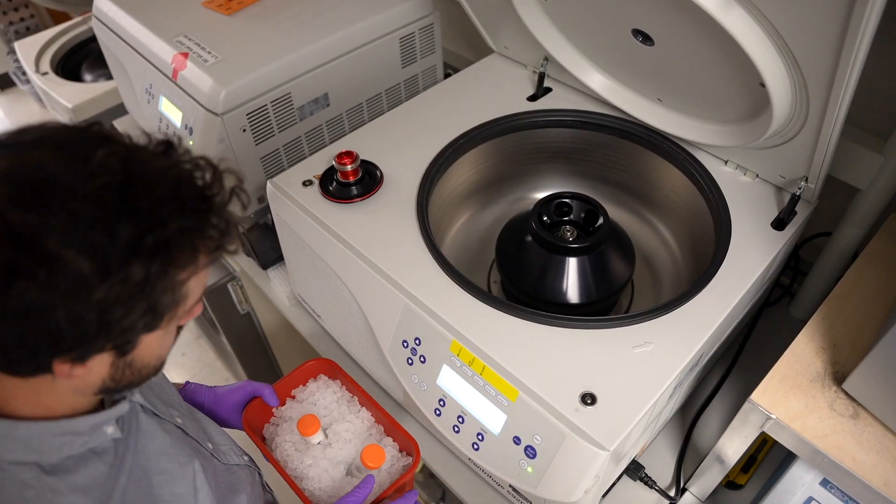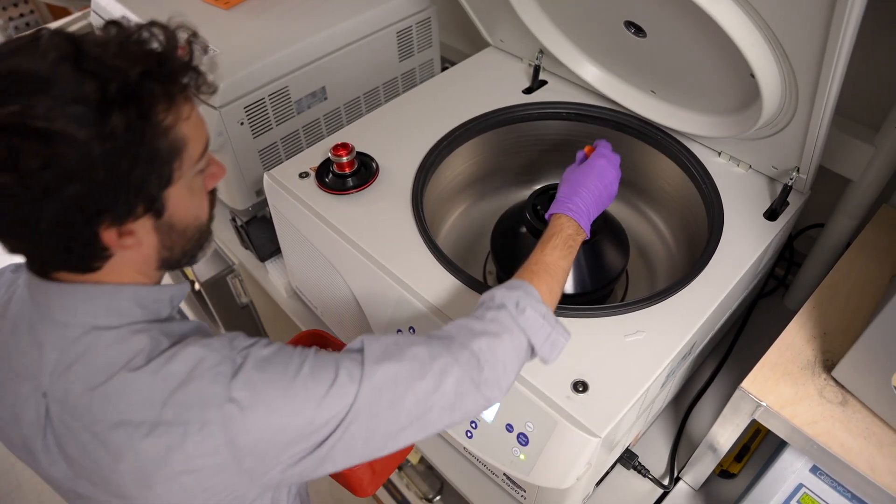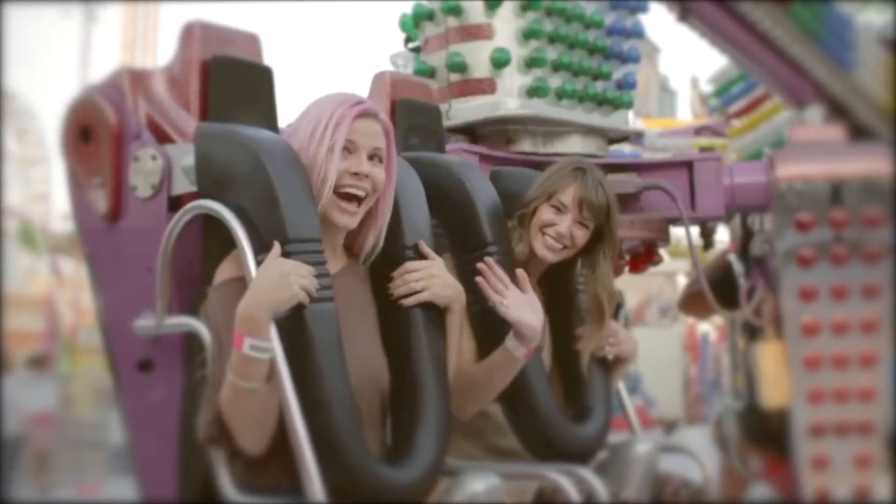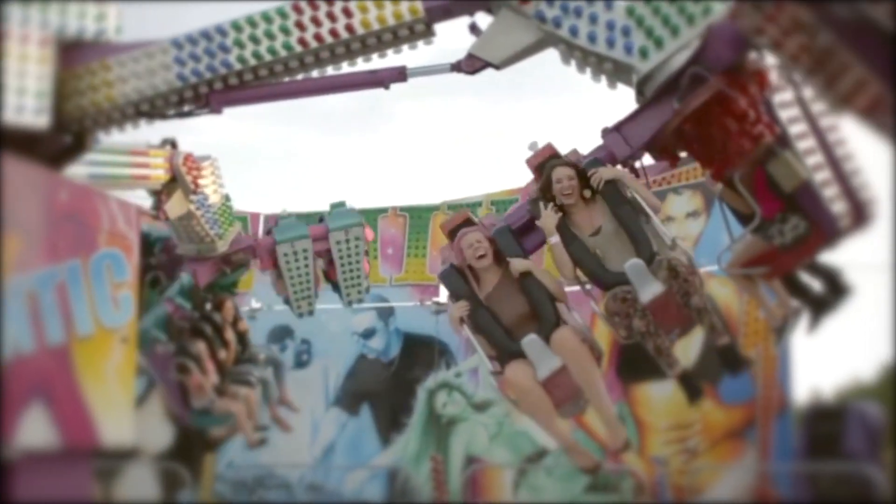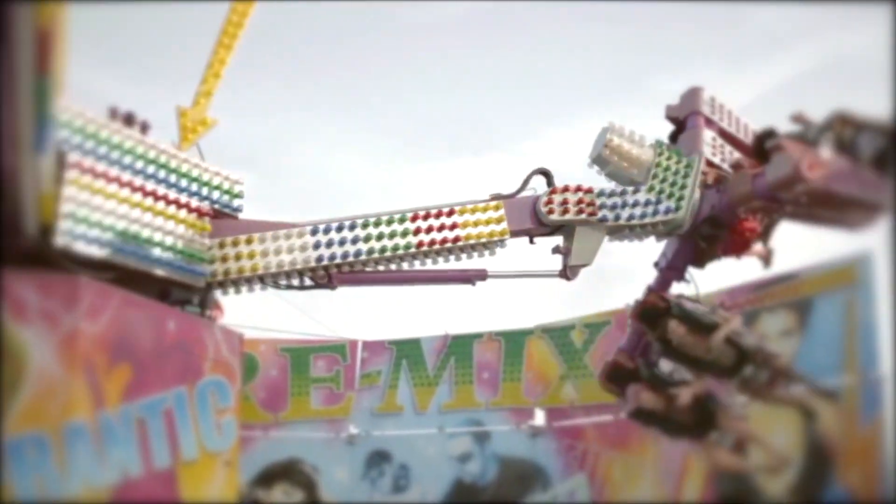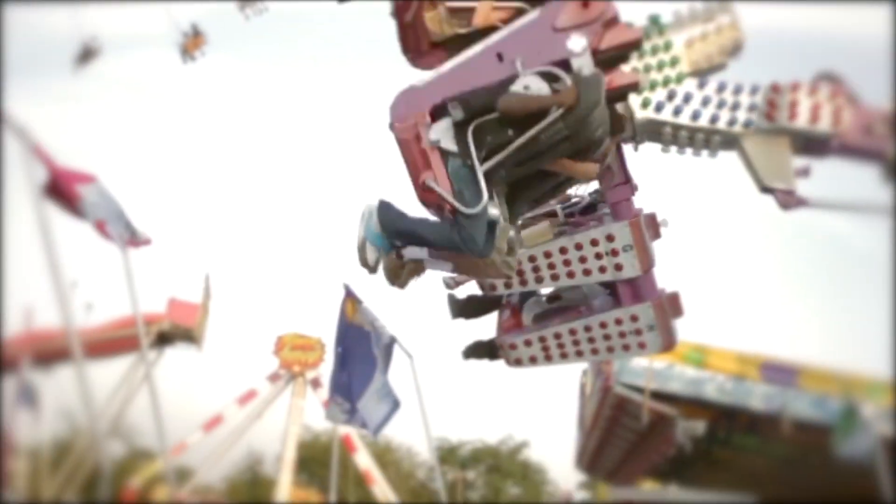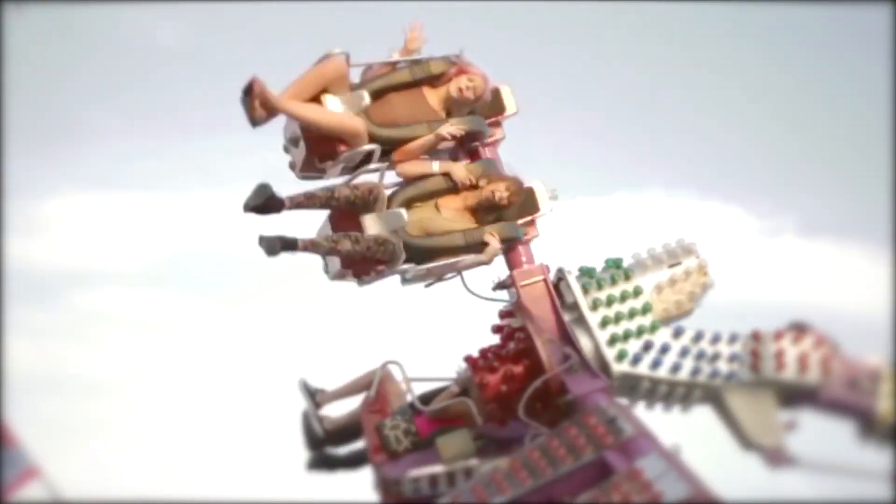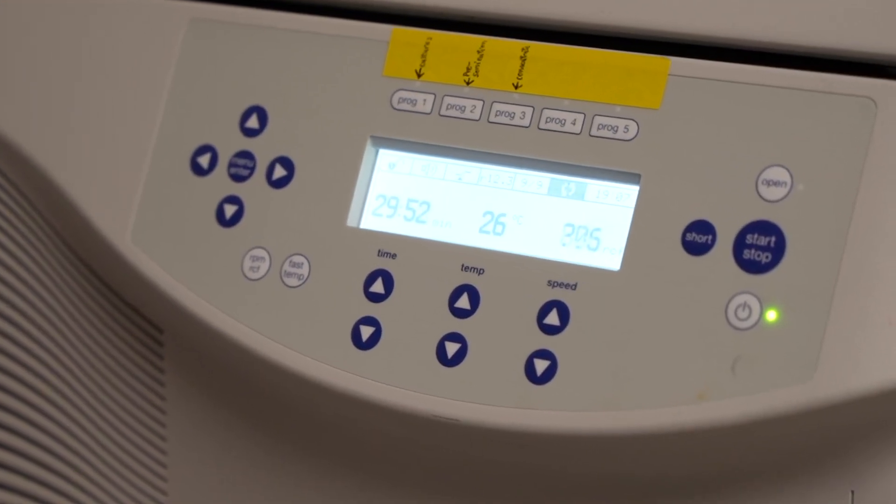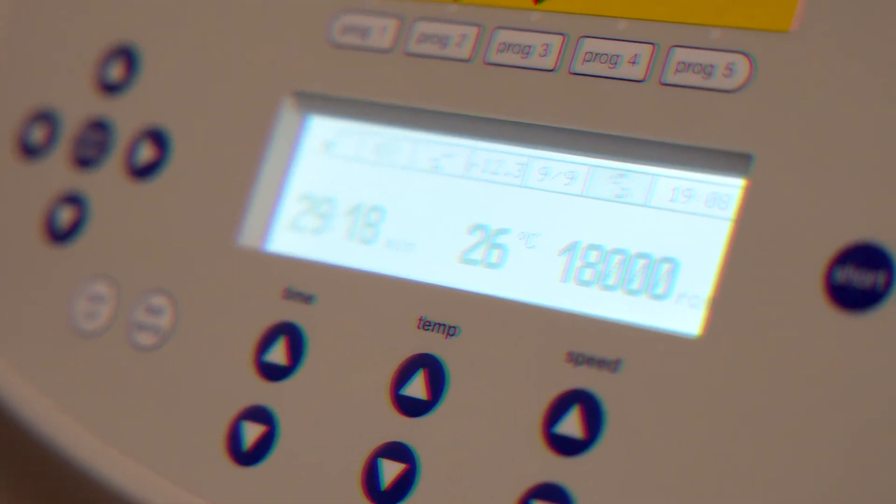We use a centrifuge to spin our samples at super high speeds. If you've ever been inside a spinning ride at an amusement park, you know exactly what's happening here. The spinning creates a force that mimics gravity, except that it pushes outward from the spinning rotor, instead of moving down towards the Earth. In this case, the force we are applying to our broken up cells is about 18,000 times stronger than the gravity you feel on Earth.